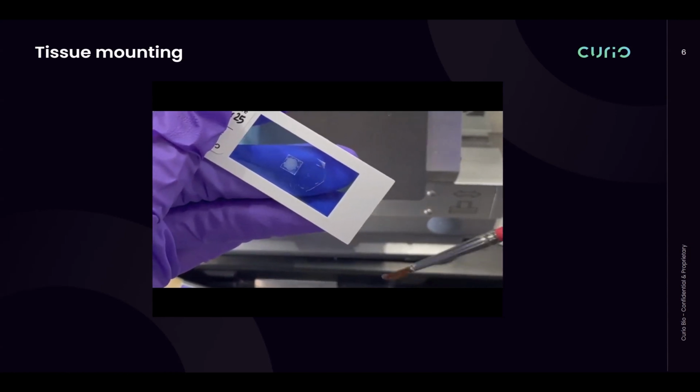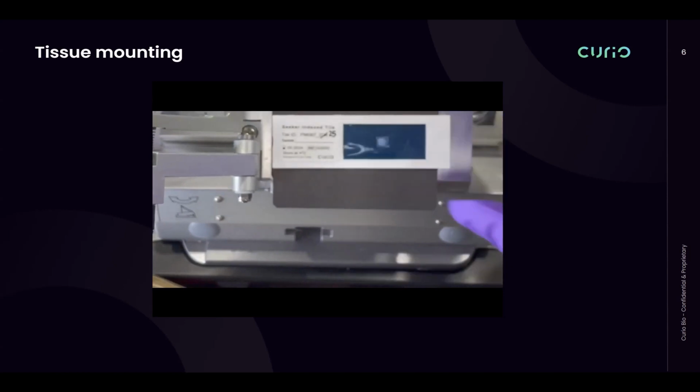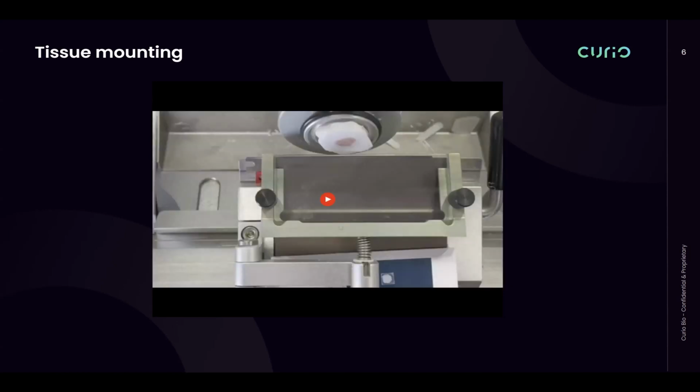But as you see, you melt the tissue once it's in position, and what you can do after this is leave it in the cryostat while you're sectioning other tissue, or you can put it in the -80 for up to 4 days and process them all at the same time. We've tested that for brain at least, and the data looks exactly the same whether or not it's freshly prepared or stored in the -80 for 4 days.